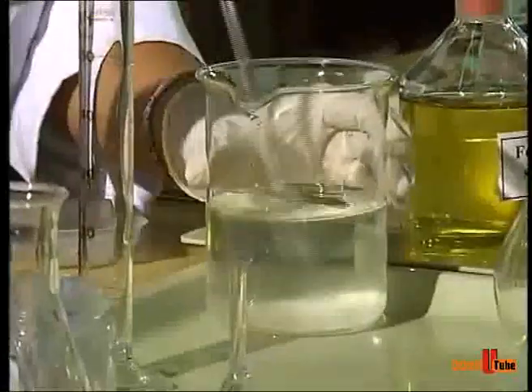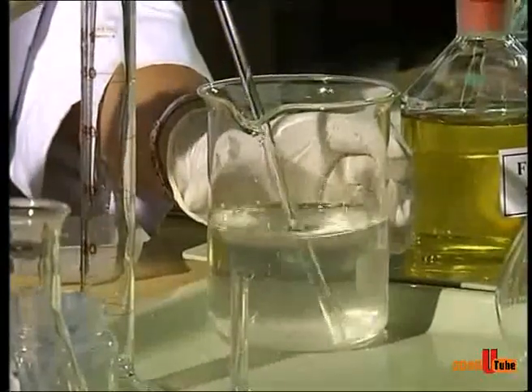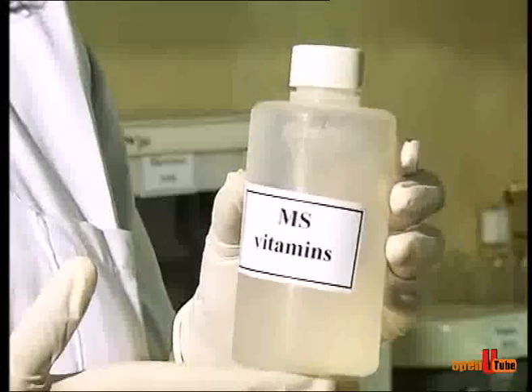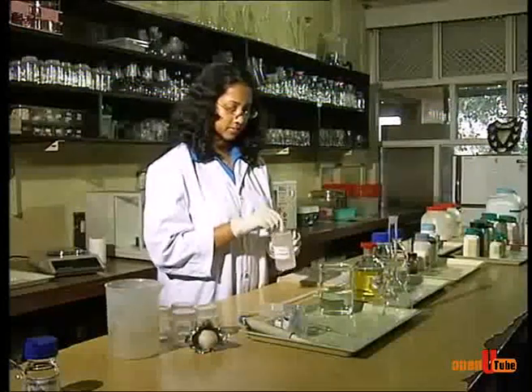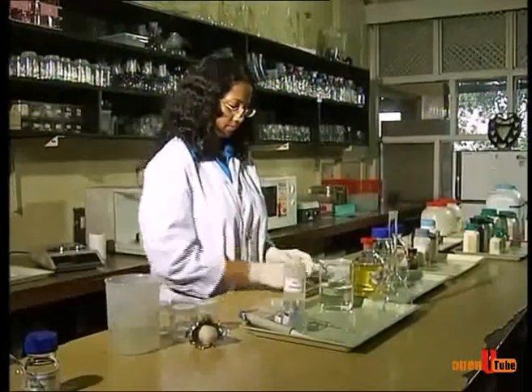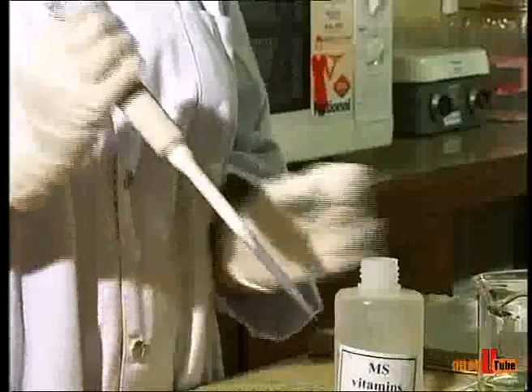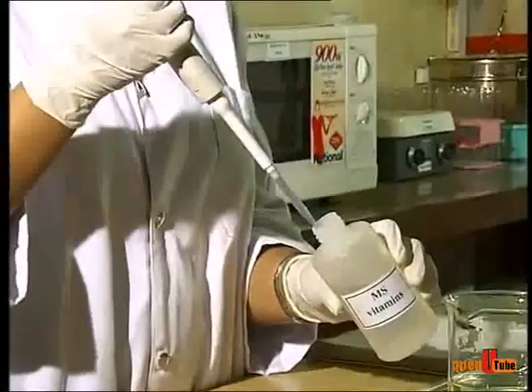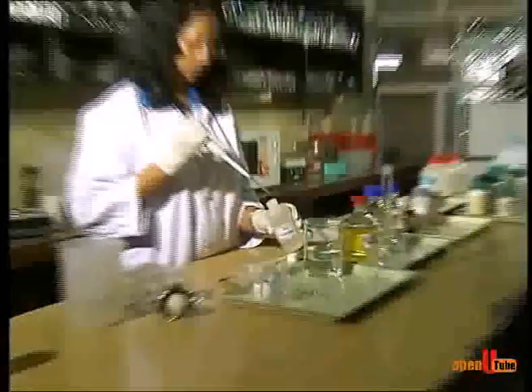Mix them well using a glass rod. With a micropipette, measure the required volume of vitamins and transfer into the beaker.